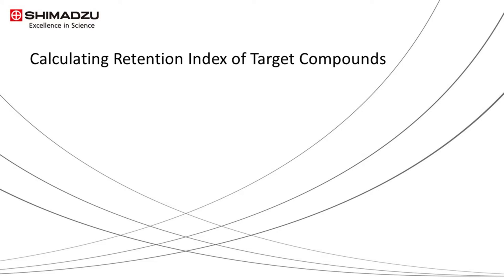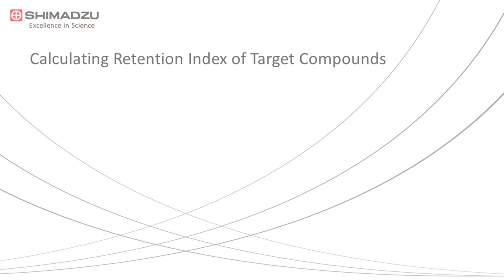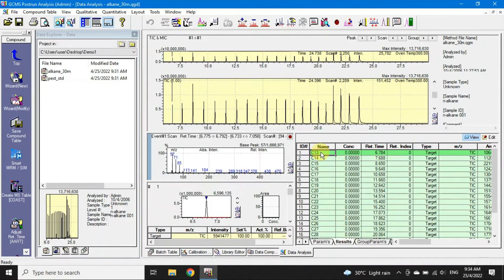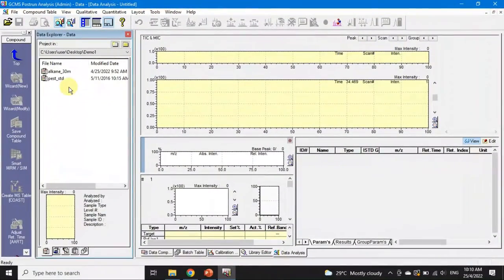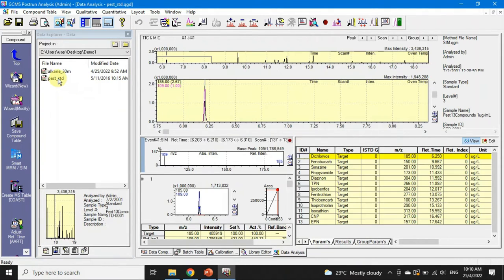This standard solution is a mixture of hydrocarbons ranging from C7 to C33. The retention index of target compounds needs to be calculated before performing AART in GCMS Solution — this step can be skipped if the method file already contains the retention index information. The n-alkane standard sample is first injected and analyzed using the standard or sample method file in GCMS. Once data acquisition is completed, load the n-alkane data file and check the result.